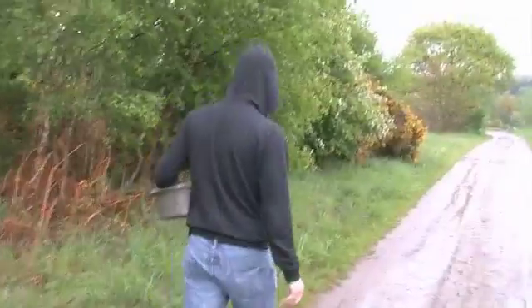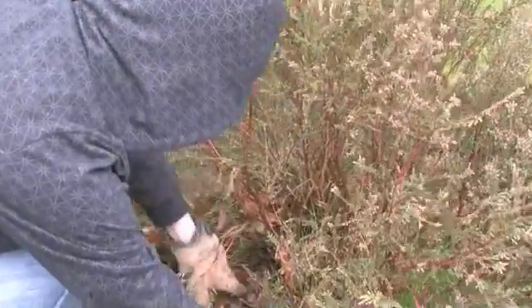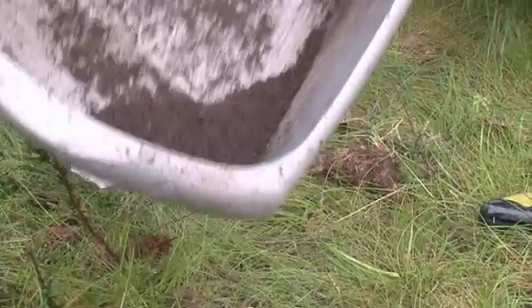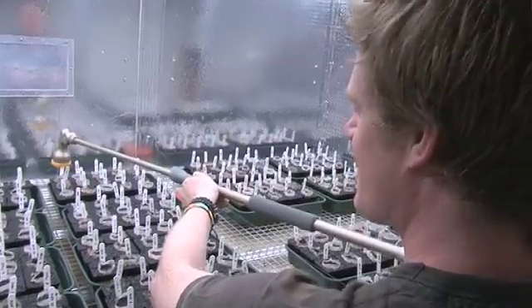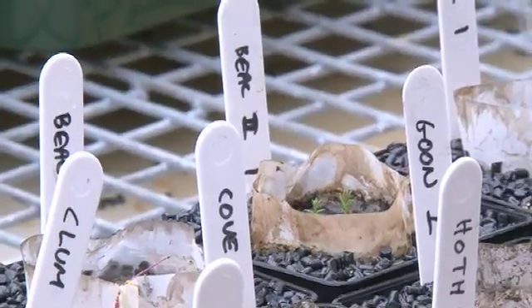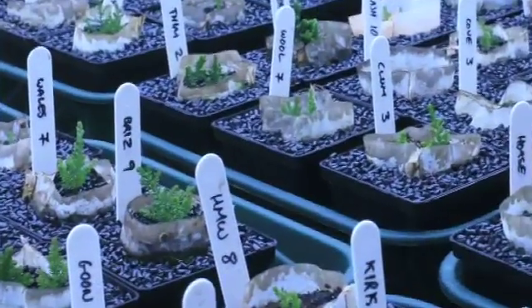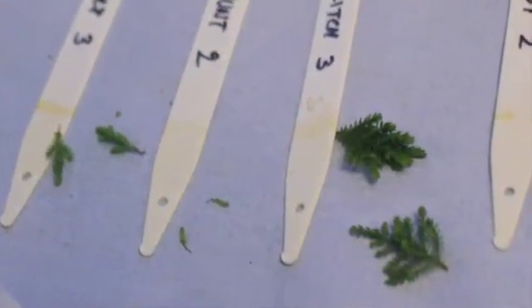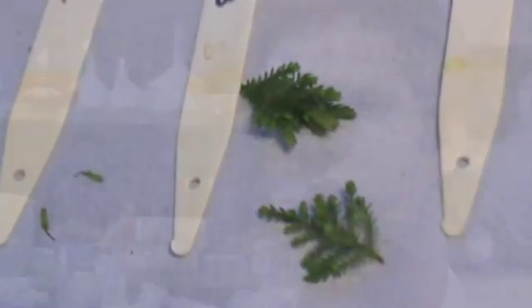What you've seen previously in these videos is me going around the country, all the way from Scotland, Lundy Island, the South West, collecting soils from different sites and then growing the same seeds in those different soils to look at how heather grows in terms of how fertile those soils were. The next stage is to look at what chemicals might be in those soils — specifically nitrogen and phosphorus — which are important for fertility and how heather might grow.